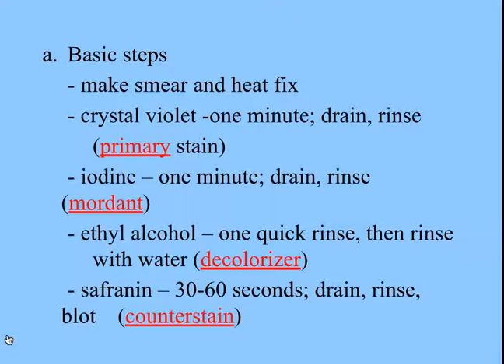The decolorizing step comes after the iodine, and that is our ethyl alcohol. And I like how the video explained drop by drop, because this is one of the steps that you can ruin the slide's actual end results if we over decolorize it. So basically do it till it runs clear, and then you can rinse it with water. Rinsing with water doesn't hurt at any point in time in the Gram stain.